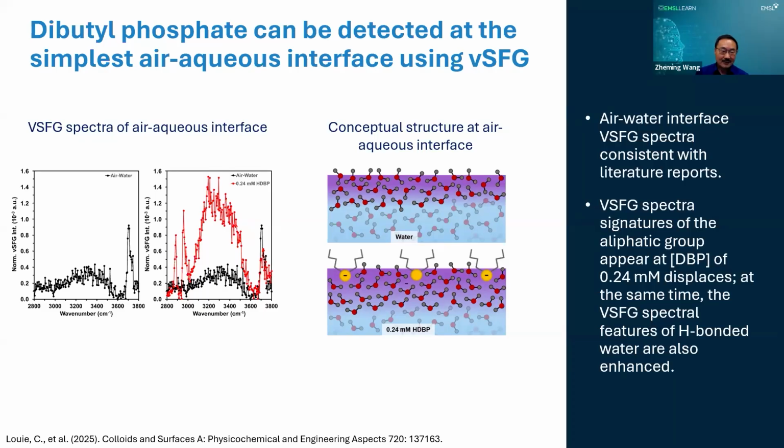This is really interesting because this can have serious consequences for a lot of biological systems and environmental systems that involve organics, biological molecules, and microbes, since it will significantly change the interfacial hydration structures, with significant implications. So many people may find such information useful to gain chemical insight for different chemical systems.